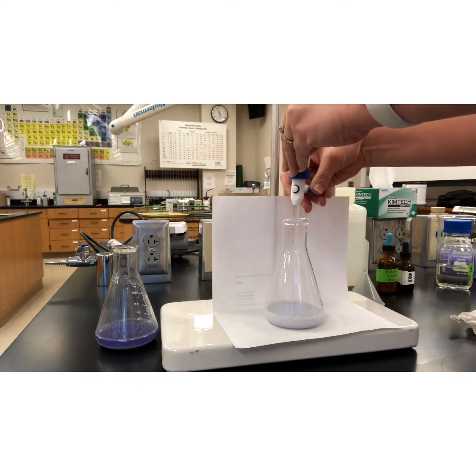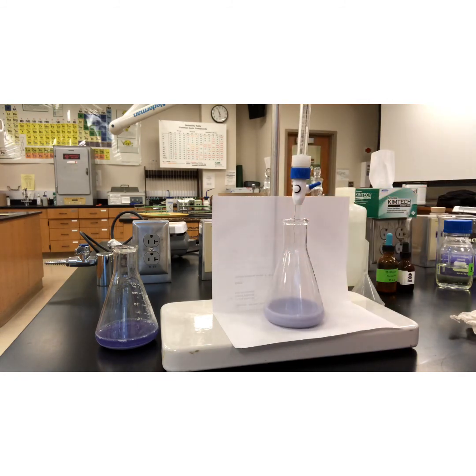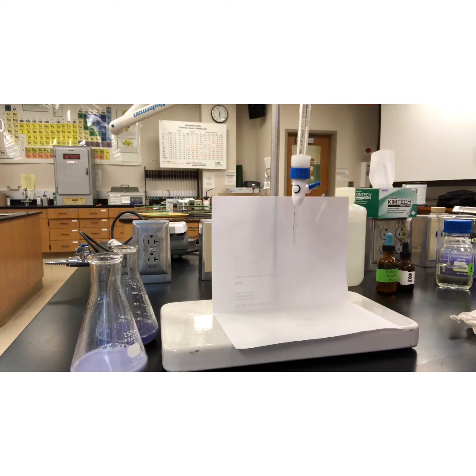Just a touch more to see that big purple color. There we go. I'm going to top off my zinc and do run number 3 for our unknown. Then I'm going to look at my delta V's and decide if we should do a fourth one or not.